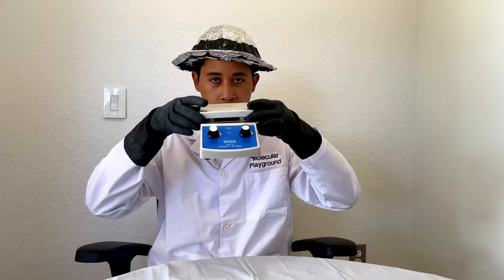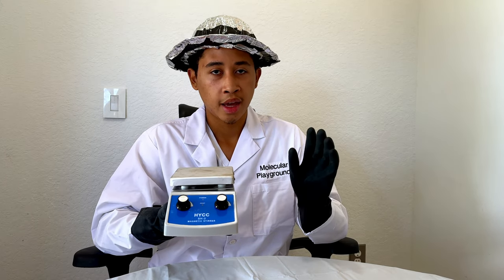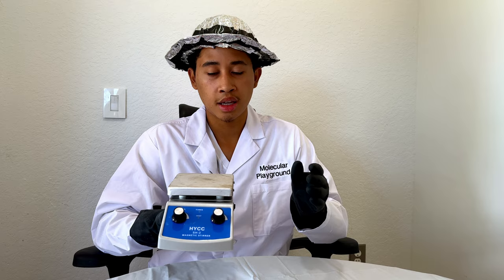When distillating, the first thing you need to decide on is your tool of choice. You can use a Bunsen burner, a heating mantle, or a hot plate. What I like about the hot plate is that it's incredibly versatile, much more than the Bunsen burner, and much cheaper than the heating mantle.